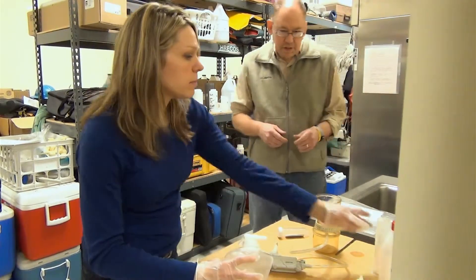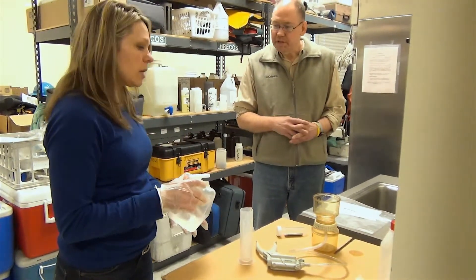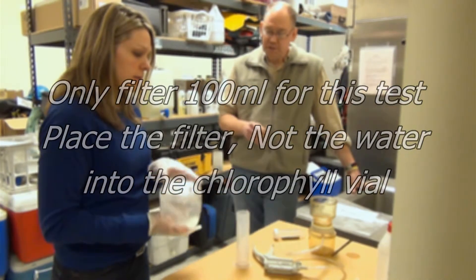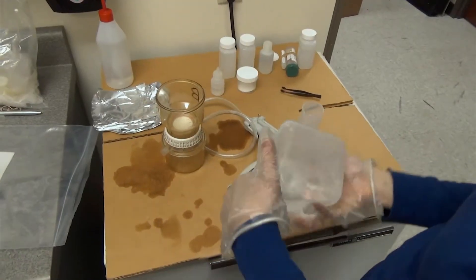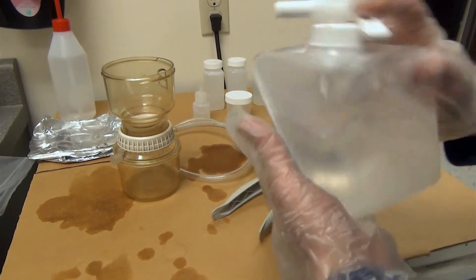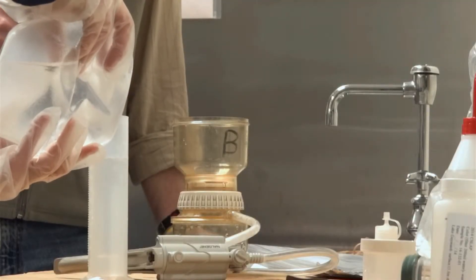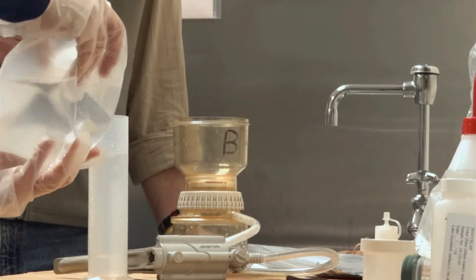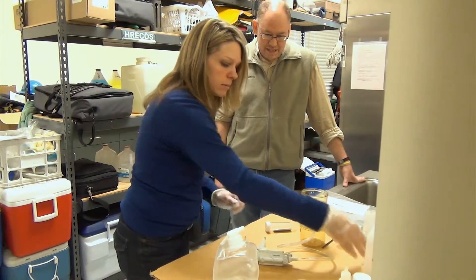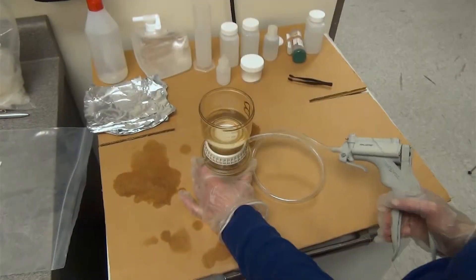Using the graduated cylinder again, fill it with 100 milliliters — for this chlorophyll test, we only do 100 milliliters. Re-invert the collapsible container to make sure any settled material is resuspended. Then pump just enough times to make sure the water starts passing through.